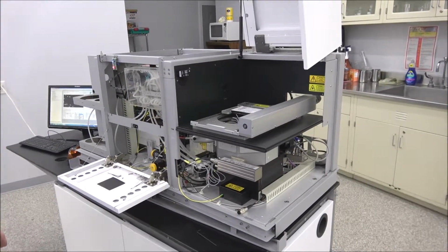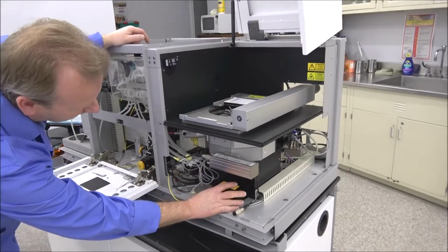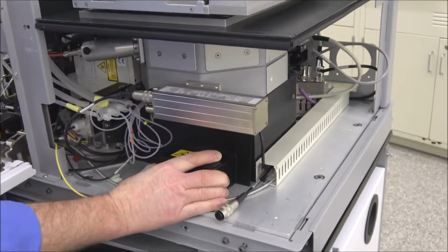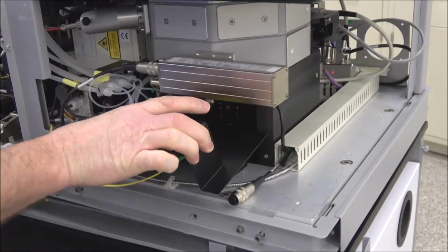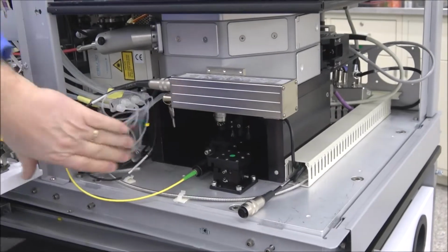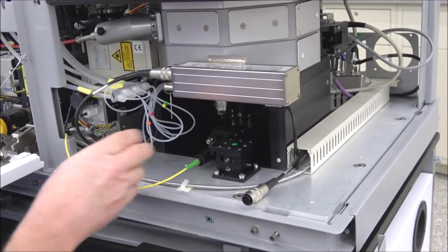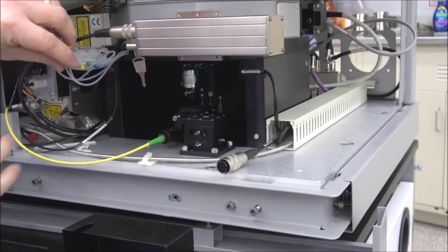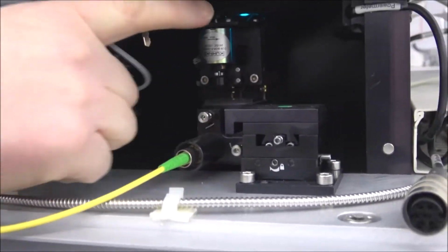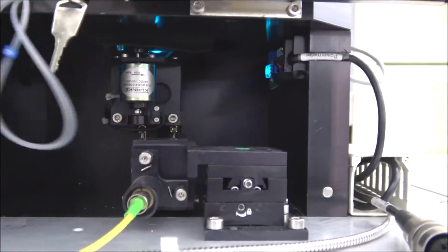And then once you got that off, you're going to see this protective cover right here, and it's just magnetically held on there, and you can just pull that right off like that. It just has some magnets here and some magnets over here, and that opens this up down here, and we're going to bring the camera down in here. I'm going to bring you around clear up to here, if you can get that shot.